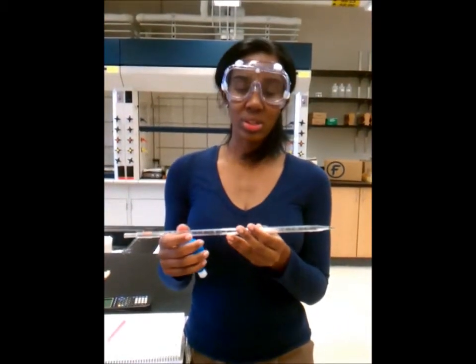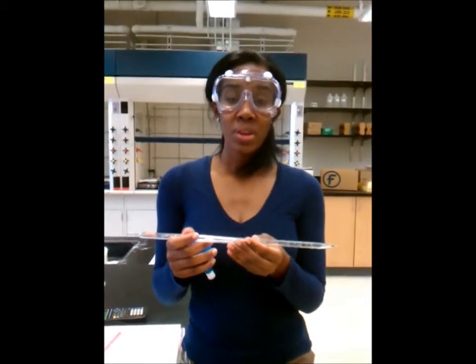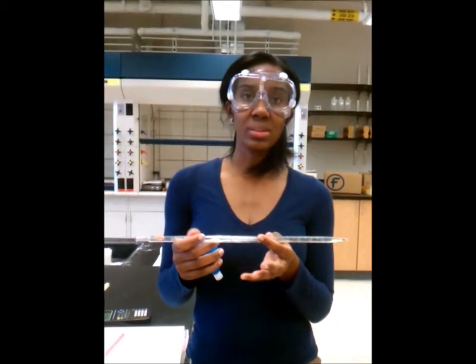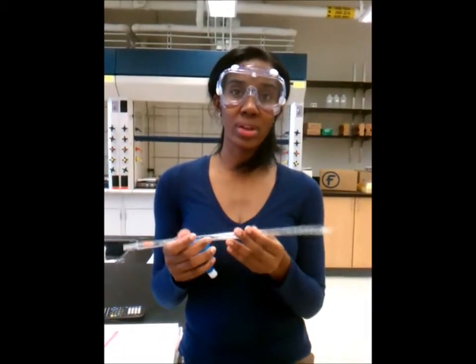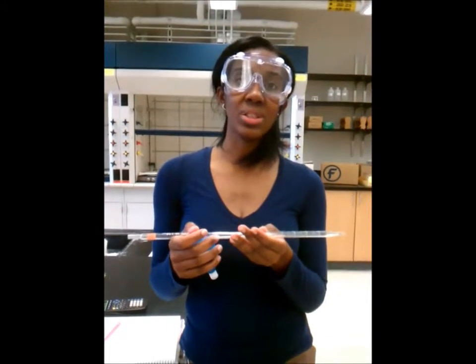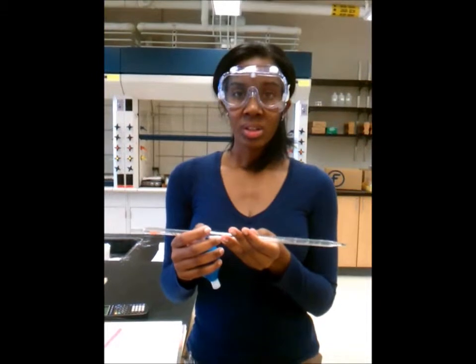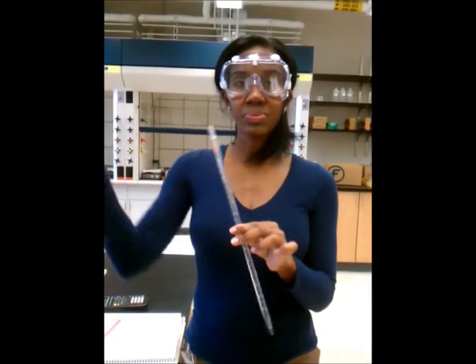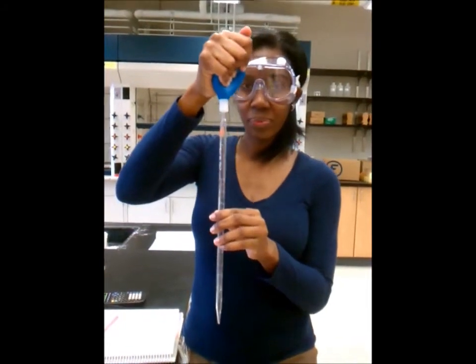Now I'm going to demonstrate the proper use of a safety pipette. First, you will make sure that it's clean by using the deionized water. You would rock it back and forth and roll it slightly 3 times. You will repeat that technique with the solution that you're going to use, rocking and rolling. Then you take the bulb, squeeze it tightly, and apply it to the top of the pipette.